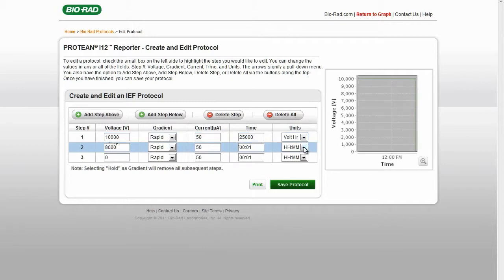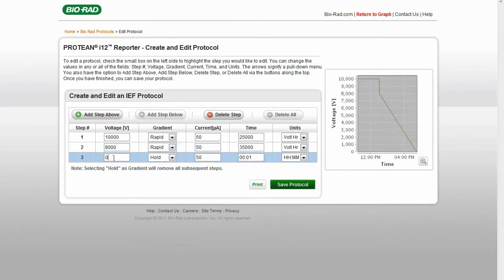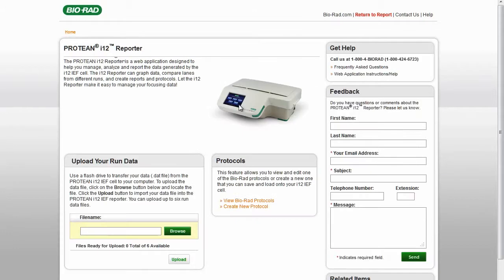One of the options under Gradient is Hold. Programming a hold step allows proteins to remain focused until the IPG strips are removed from the instrument. The hold step is always the last step in a protocol. No steps can be programmed after a hold step. Again, you can save the new protocol on a flash drive and transfer it to the Protein I-12 IEF cell for use.